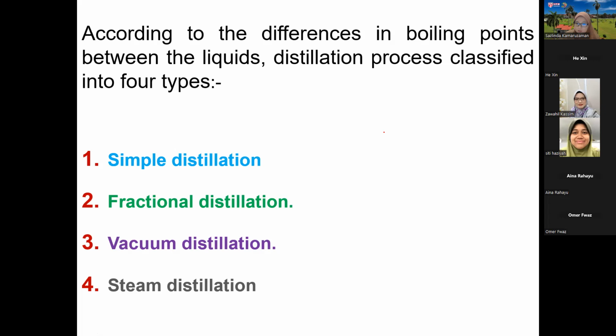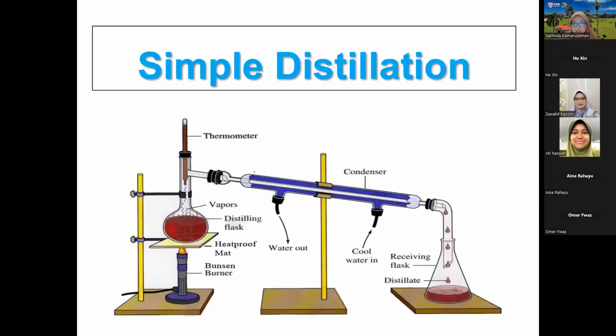Most importantly, why do we need to introduce you to different types of distillation? Because when you have a mixture with different boiling points, which distillation is more fitted to do the separation? So there must be a reason to have different types of distillation.